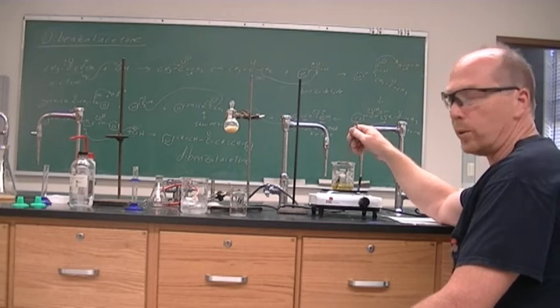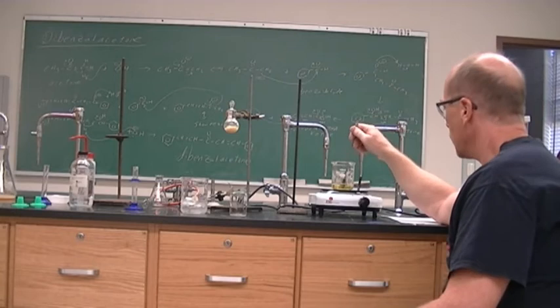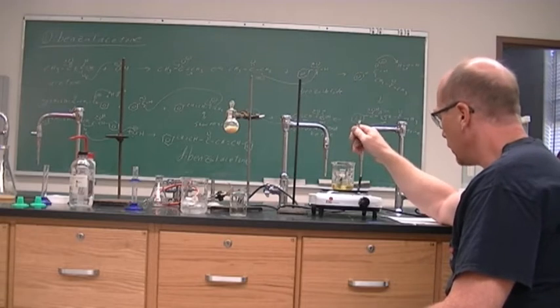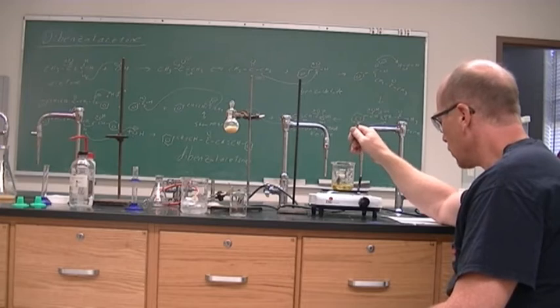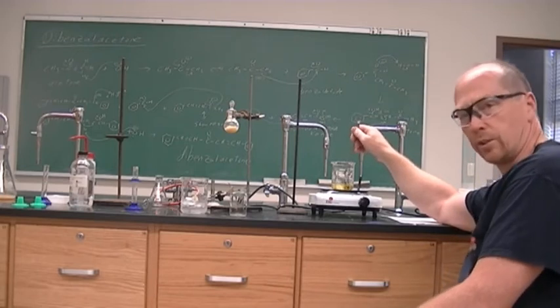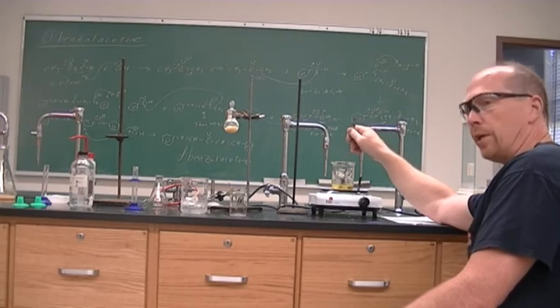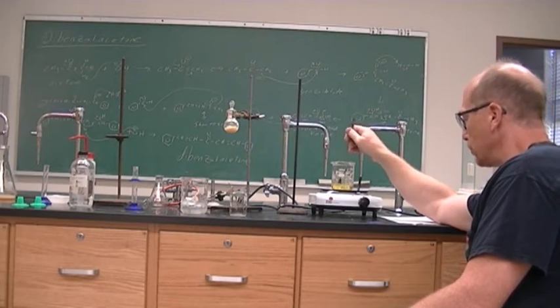Alright, and so when you do a recrystallization, sometimes it is very difficult to get the crystals to reform. So I'm going to concentrate this by boiling down the solvent. And you'll know you're getting close if you see that when it's boiling, this is a nice clear solution. If you see it getting cloudy, then you know that you are ready to start forming some crystals.